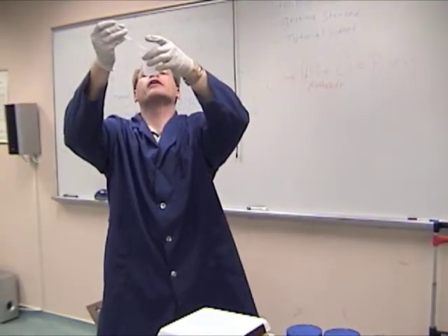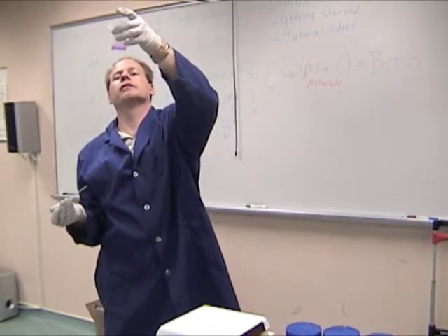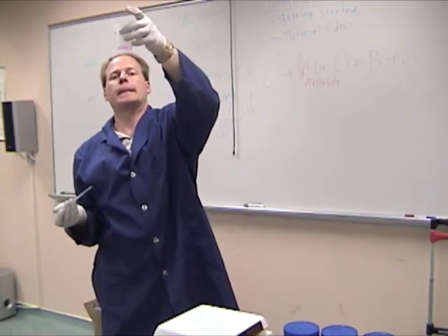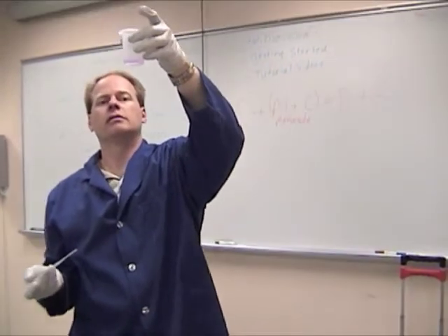This should be pretty good alcohol. Yeah, just turned. And see how it's turning back? So does that say that alcohol did pick up some contaminant? That alcohol's good. That alcohol's probably at 7.